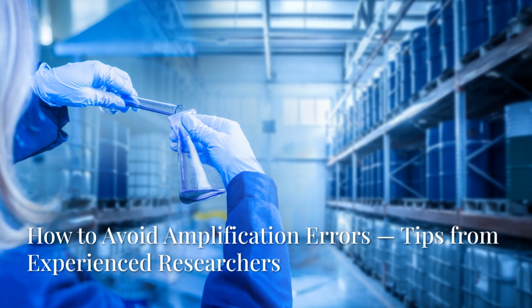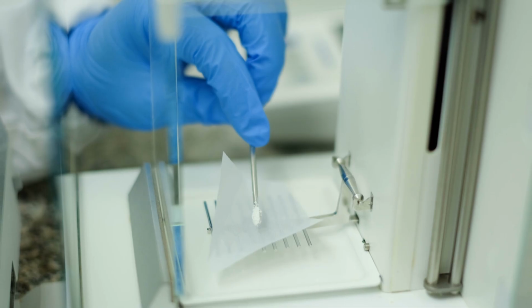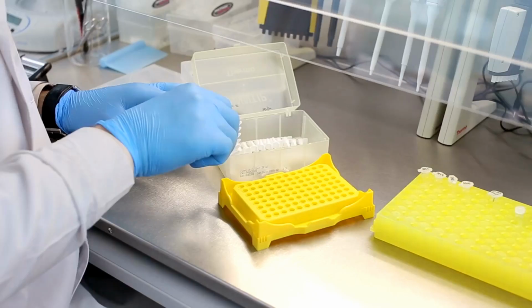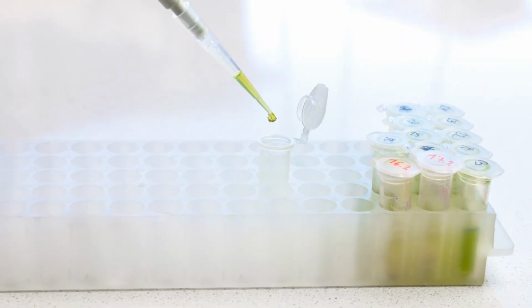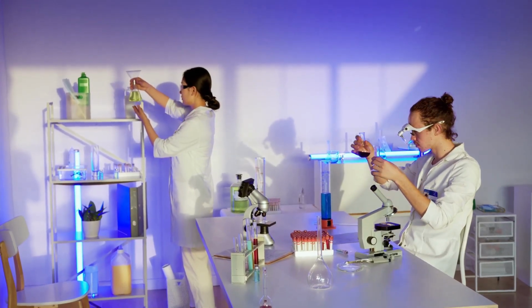How to avoid amplification errors. Tips from experienced researchers. Contamination is really the enemy of amplification. Always make sure to separate your pre- and post-amplification areas, use filter tips, and include negative controls. It's also important to optimize primer design and reaction conditions for your specific target.